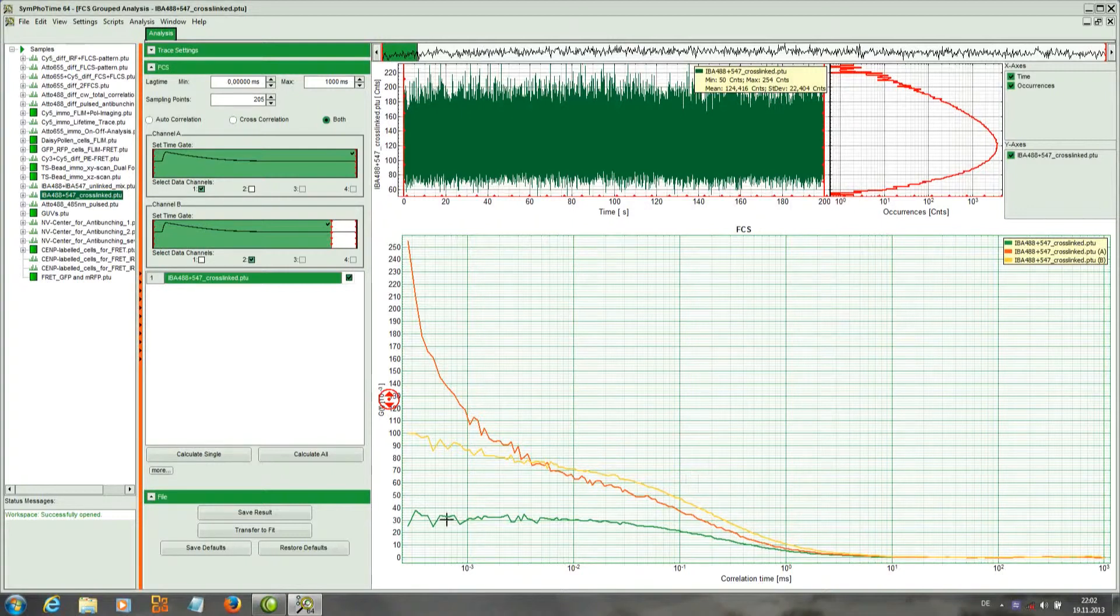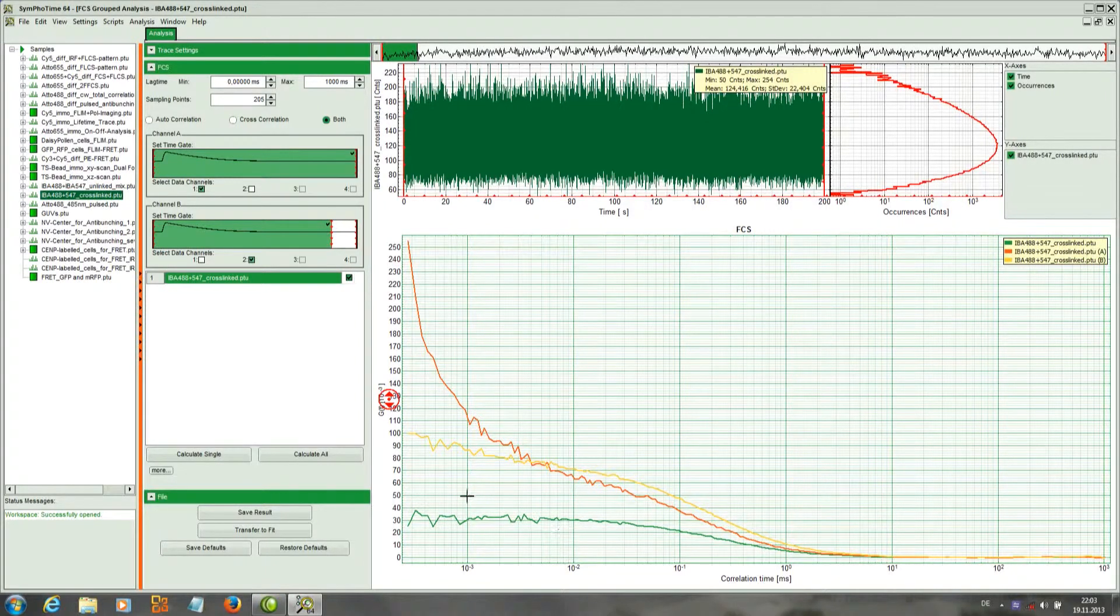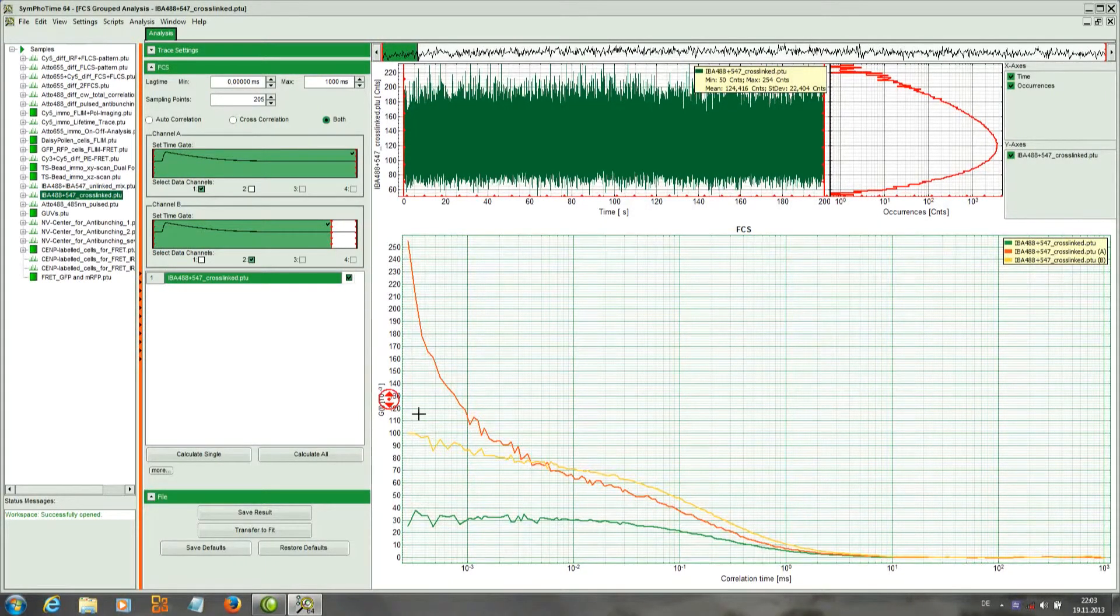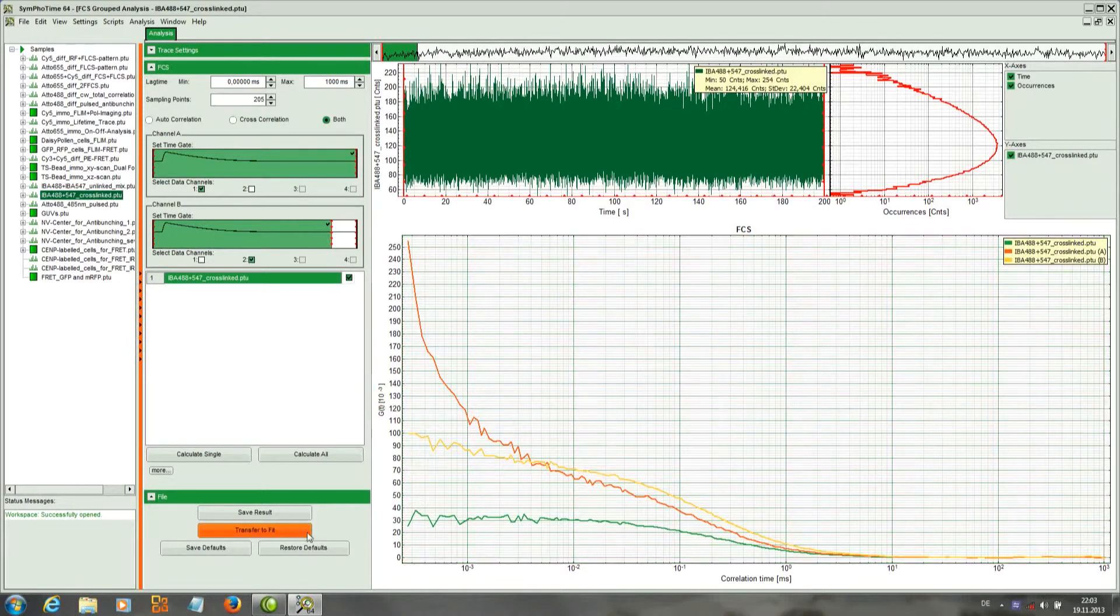The green curve is the cross correlation, and from the ratio of the amplitudes you can estimate how good is the overlap between the red and the green volume.